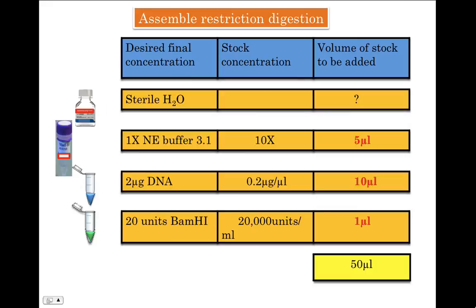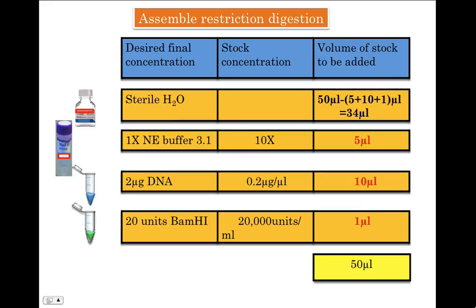Now we need to make up the volume to 50 microliters by adding water. We simply add 5 (buffer) + 10 (DNA) + 1 (enzyme) = 16, and subtract from 50, which gives us 34 microliters of nuclease-free water to add. Once you mix all the components, spin lightly in a microfuge, and subsequently incubate the tube in a water bath at 37 degrees Celsius.